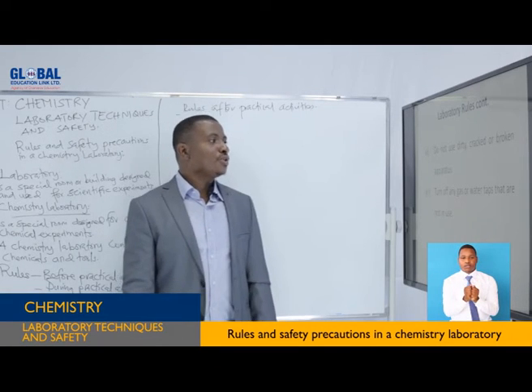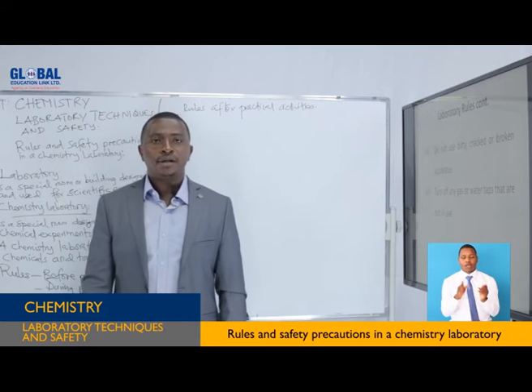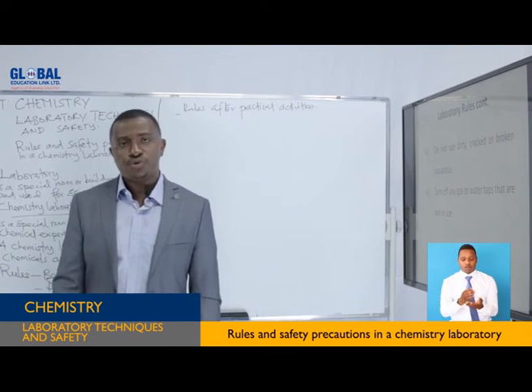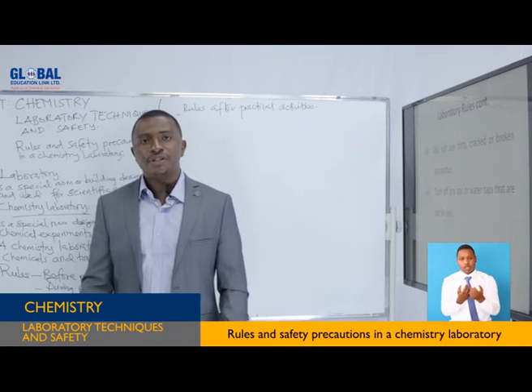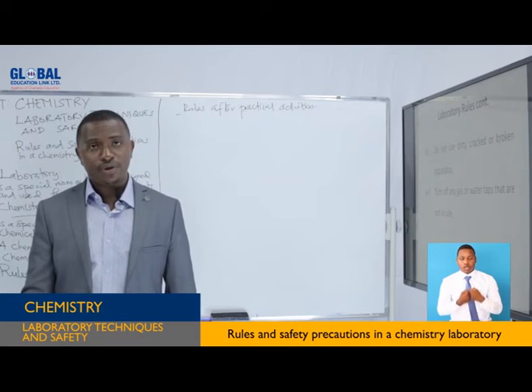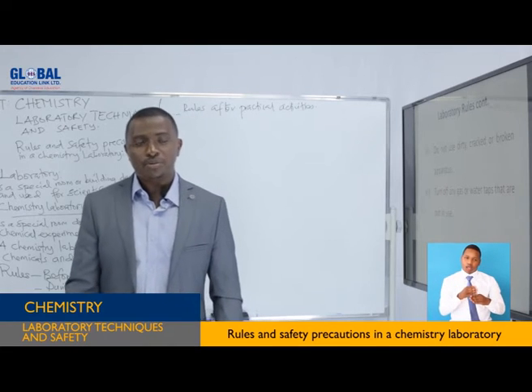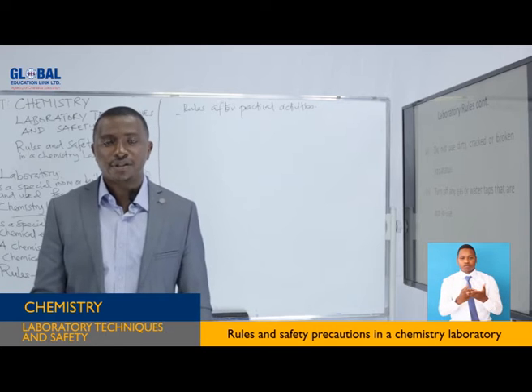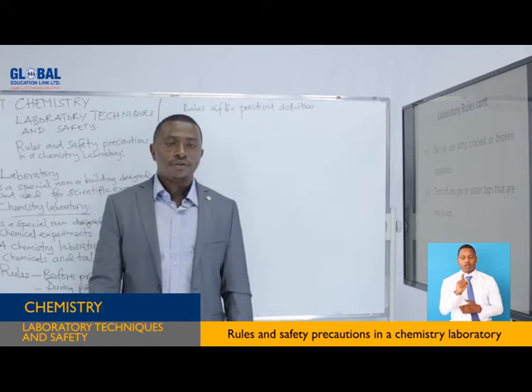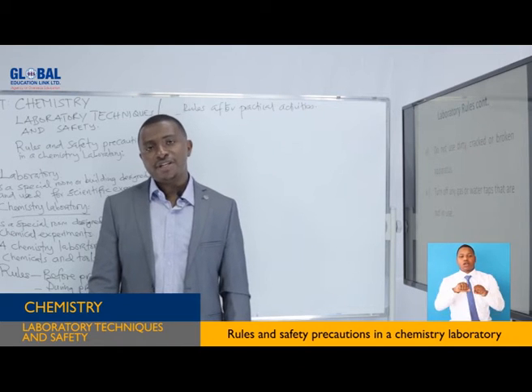Also, do not use cracked or broken apparatus. Students, let's say you are using a cracked beaker or a cracked test tube. You can touch it accidentally, then it breaks. When it breaks, it can result in an accident to you. It can result in burns, it can result in cuts, because maybe it had some chemicals and it had cracks. Therefore, you should not use dirty, cracked, or broken apparatus, because they are very dangerous, they can harm you.